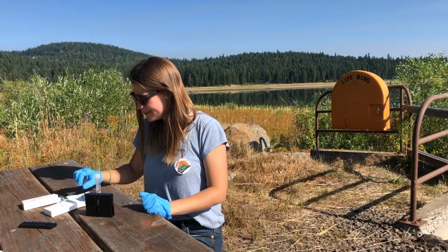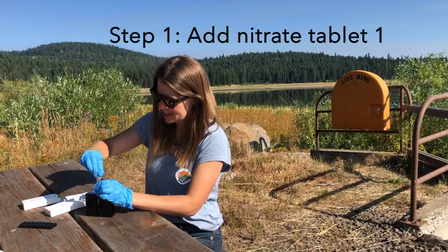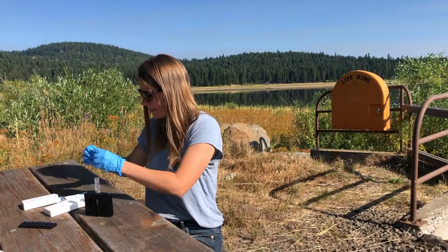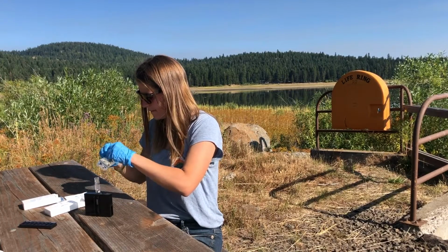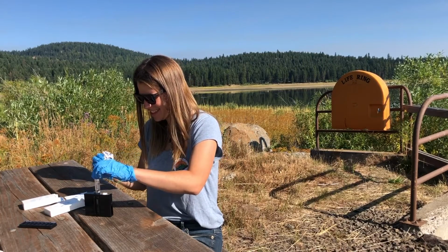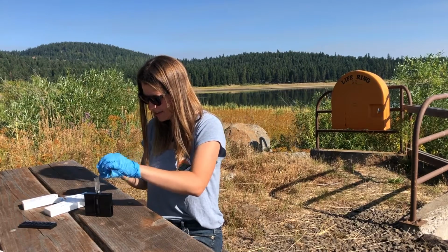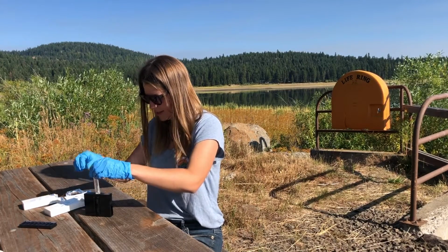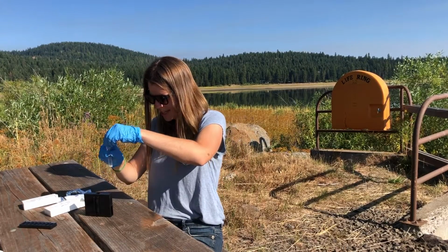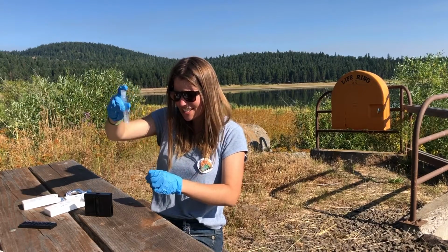So, the first step is to add Nitrate 1 tablet to the solution. Okay, and it needs to be topped and says to mix until it disintegrates.